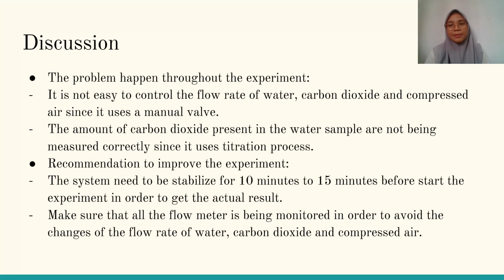During the experiments, there were some problems that we faced. First, it is not easy to control the flow rates of water, carbon dioxide, and compressed air since we used manual valves. So each of us needs to monitor the valve. The amount of carbon dioxide present in the water sample is not measured accurately since the titration process is used.